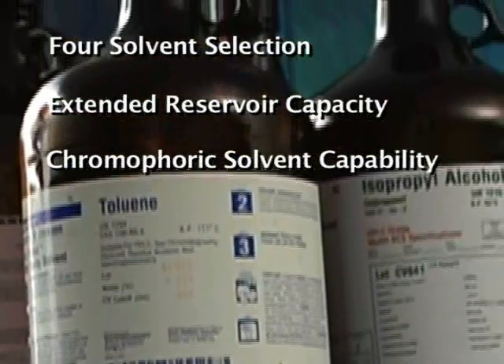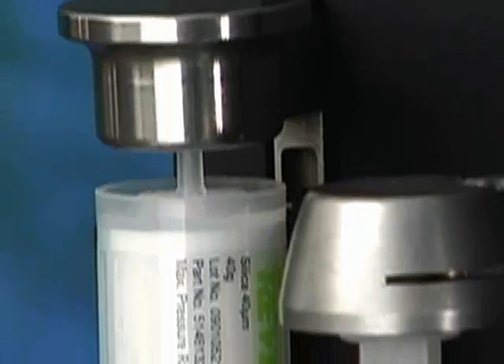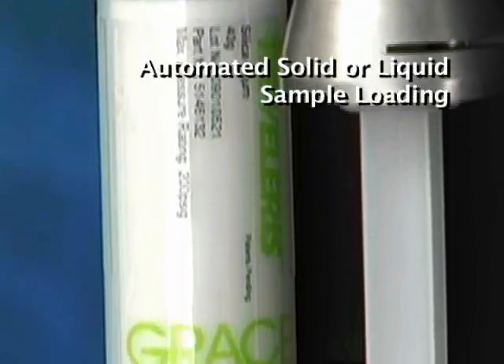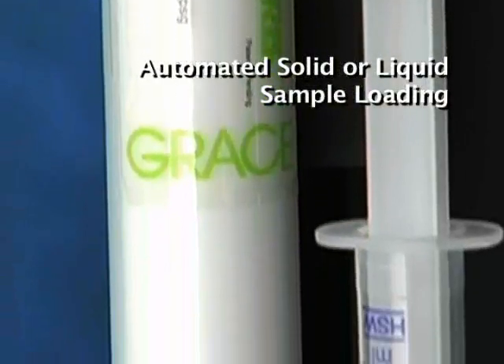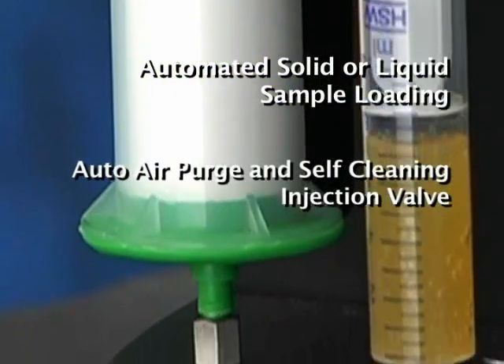Solvent management is easy with waste level and leak detection. The plug-and-play interaction of the Revolaris system incorporates automated solid or liquid sample loading, auto-air purge of spent cartridges, and a self-cleaning injection valve.